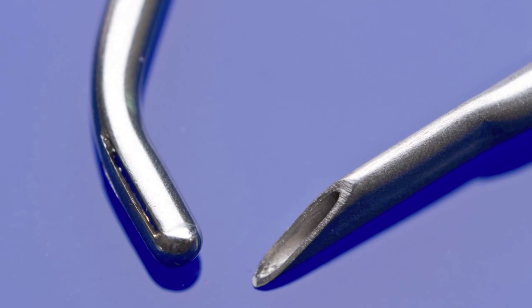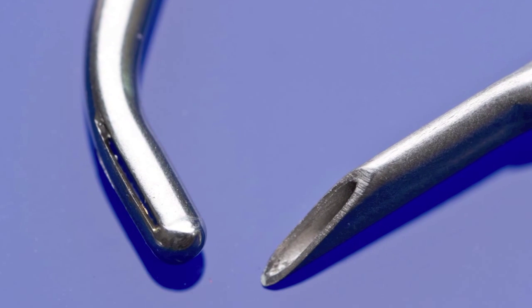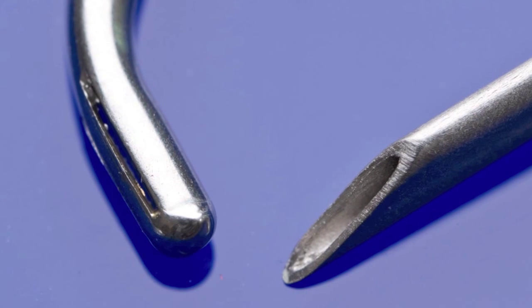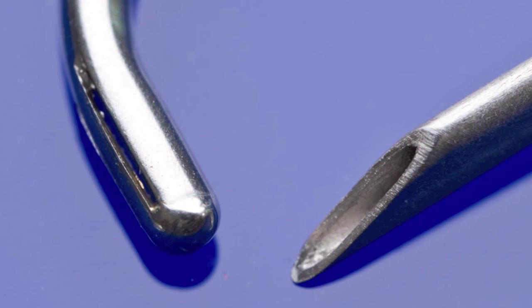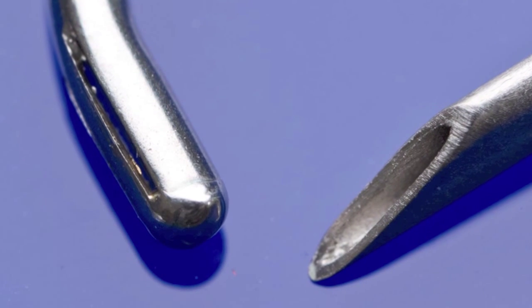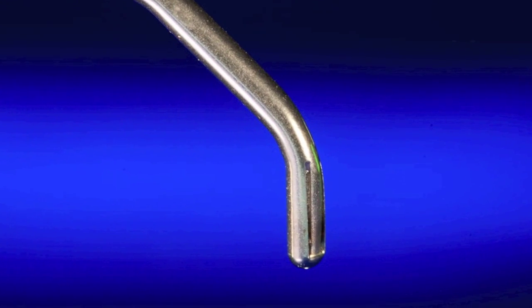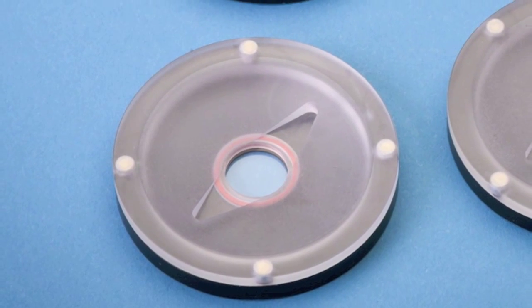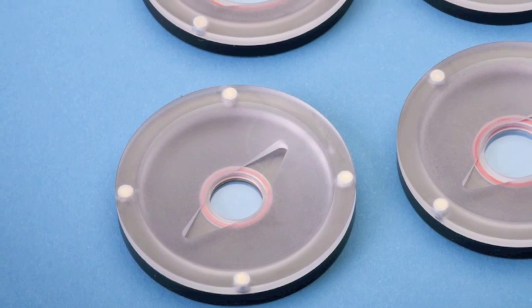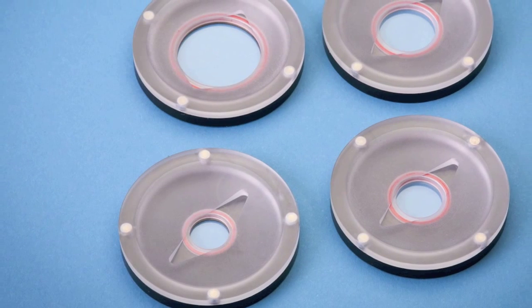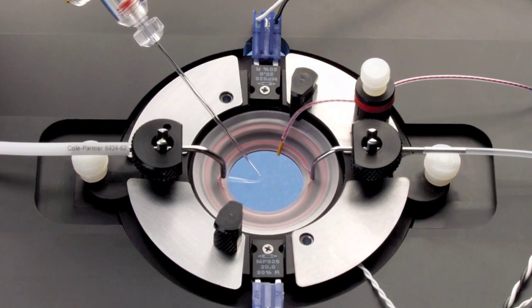Microslit suction tube design improves the quality of laminar flow in round bath chambers, improves the quality of aspiration, and allows for direct setting of the bath height by a simple positioning of the suction tube in the bath. The microslit design employs a plugged luminal hole with slits around the circumference that facilitate the collection of solution from the edges of a round bath, thereby improving the quality of laminar flow in these chambers.